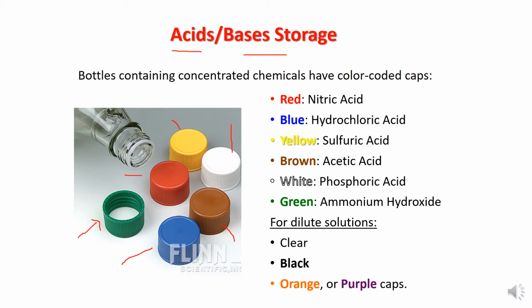If you remember this information and you are working in the lab, then according to the cap color you can recognize which particular acid it is. Although there is also labeling on the flask, you should not mix these caps or switch them with each other.